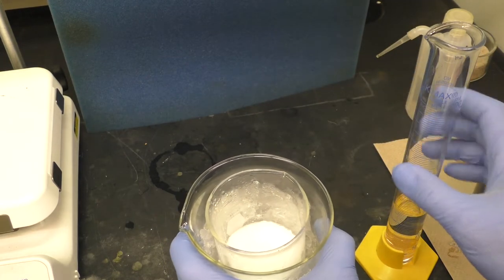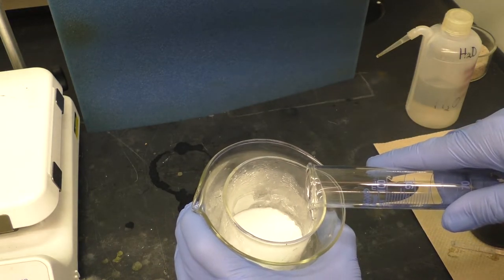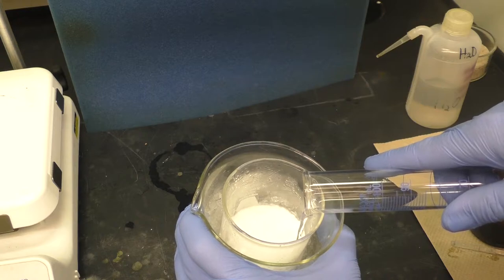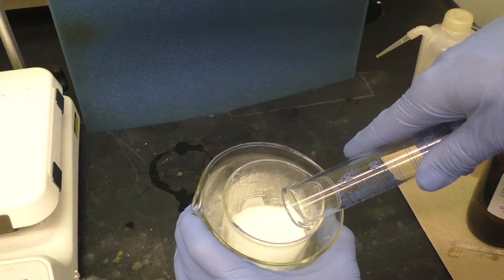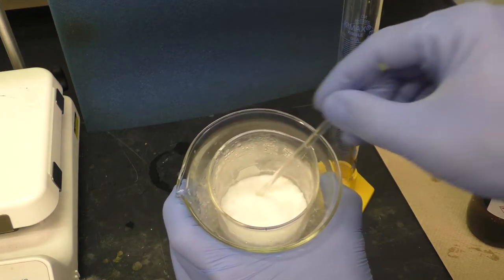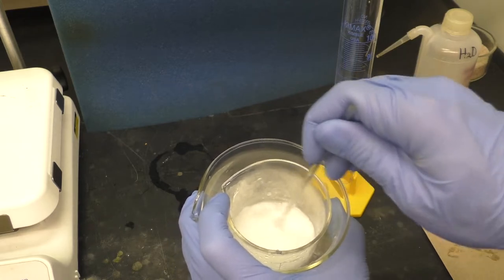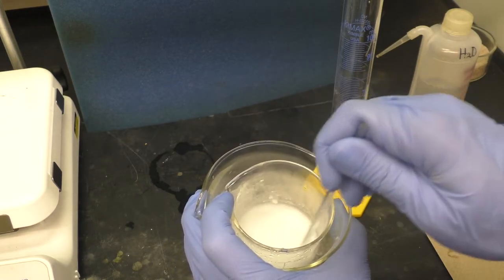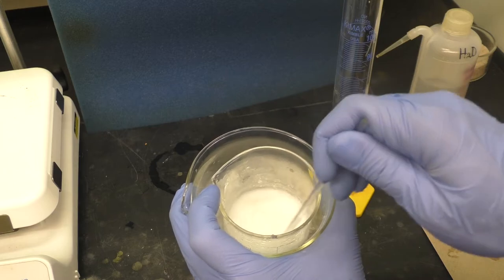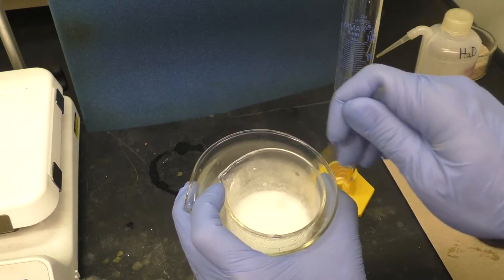Lower that down in the ice bath a little bit more. Added the entirety of the sulfuric acid. Stir the solution up, then make sure that everything has a chance to react. Sort of protonate, neutralize. It's a good thing that I have this in the ice bath, otherwise this would be very hot and probably boil and overflow the beaker here.